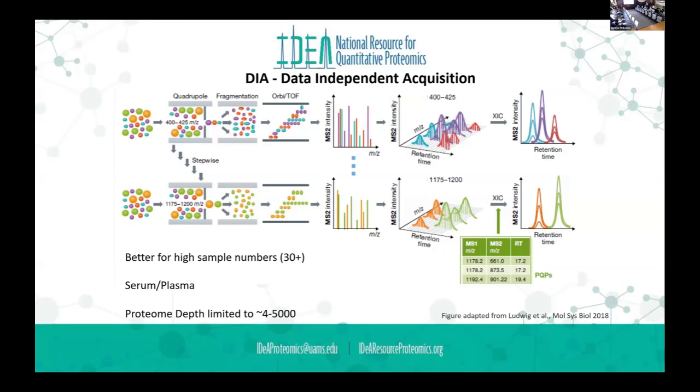And in the proteome depth, we initially were saying 4,000 to 5,000. This is kind of when we were using the Scaffold DIA. And so now, on our systems, this is in the 6,000 to 7,000 protein range, regularly. But that number is essentially doubled. And so with new instrumentation, you're looking at 9,000 plus proteins identified and most of them quantified.